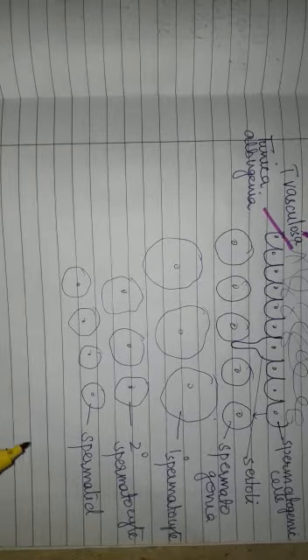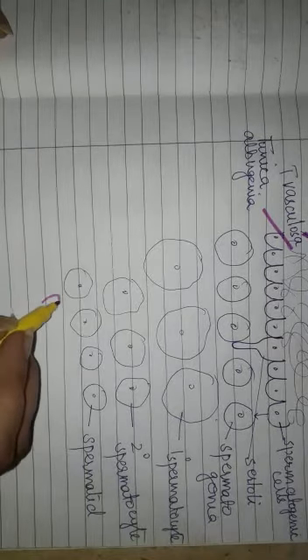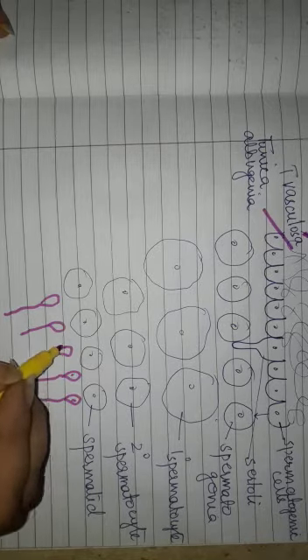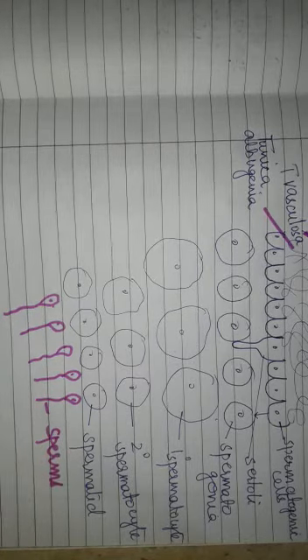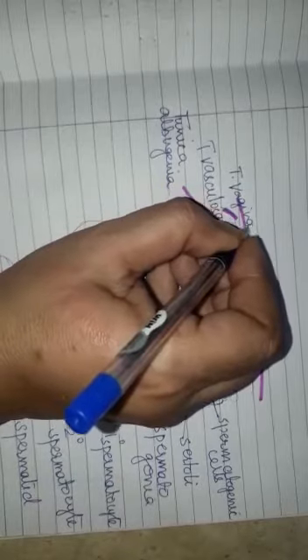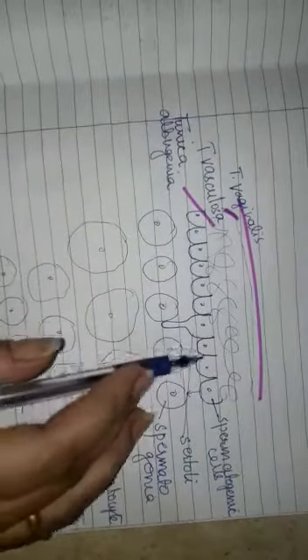Now these spermatids will undergo certain morphological and physiological changes, and they will metamorphose into the sperms.